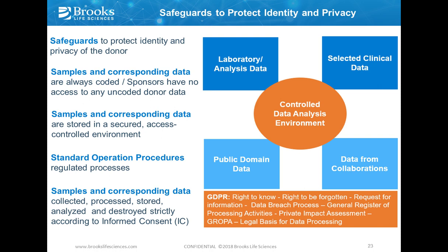Then standard operating procedures, at least in pharma, they are standard. We need them. We work under GCP, and the samples are collected under GCP, and they stay under GCP, also if we use them later on for research purposes. Of course, we do not need to validate our equipment and our methods for research purposes, but we still need to have the audit trail on this sample.